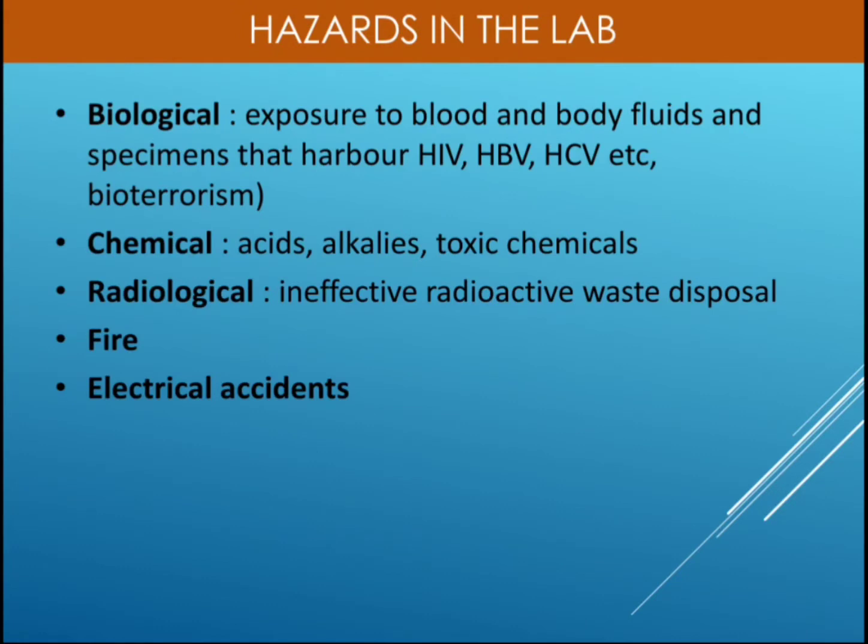Now, what are the hazards in the lab? First is the biological hazard. From the microbiological point of view, biological hazard means exposure to blood, body fluids and specimens that harbor HIV, HBV, HCV, etc., and that may cause bioterrorism. You know that in Wuhan's lab, this coronavirus is believed to have leaked, which means it has been exposed to the outer environment. So biological hazard has to be taken into consideration.